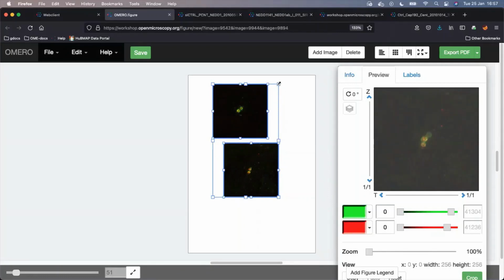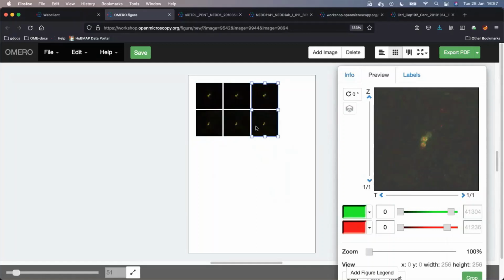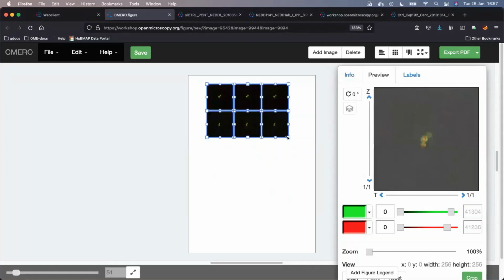This is done as easily as possible. For example, I can align those images to grid, make them smaller, and then very quickly copy and paste, let's say, 3 columns, and adjust them again. I can use the up and down arrow keys.